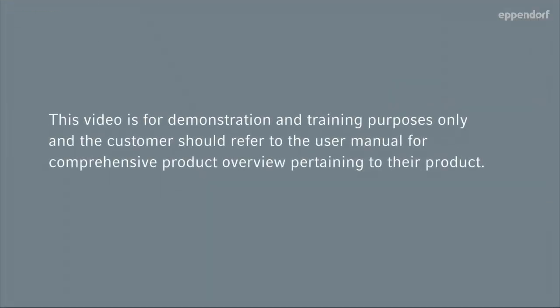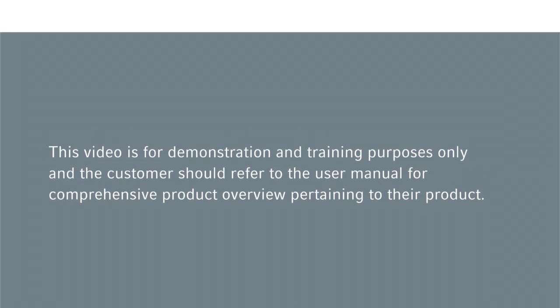This concludes our demonstration on how to connect your computer to a New Brunswick Bioprocess system and how to use BioCommand software.